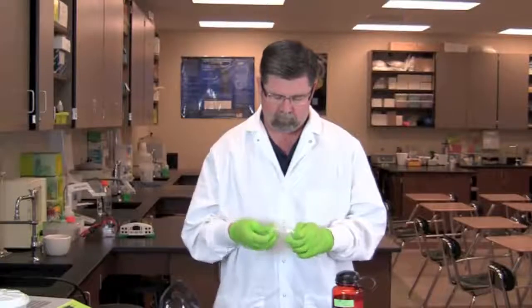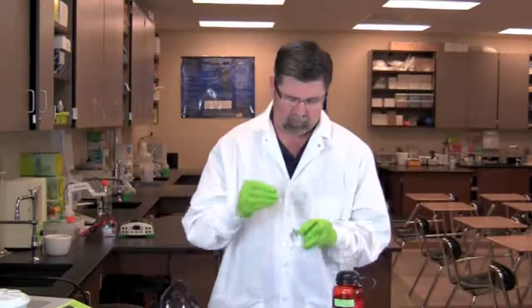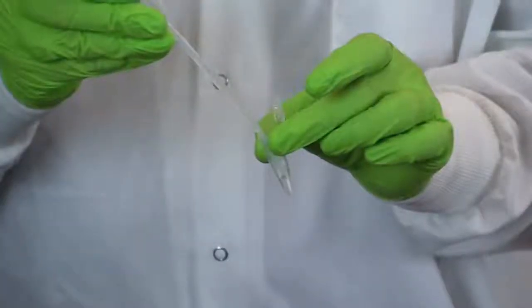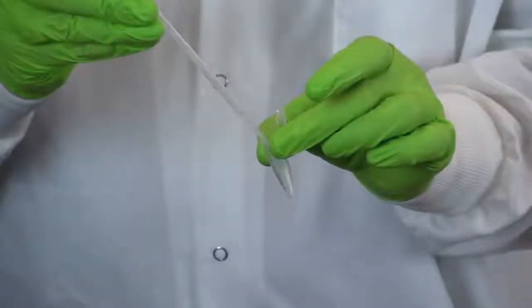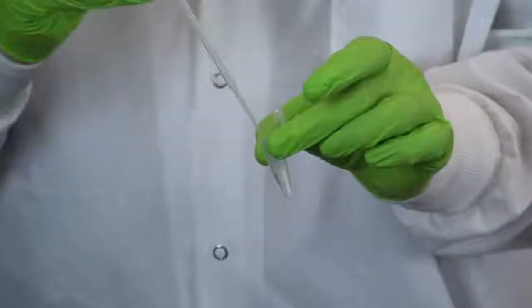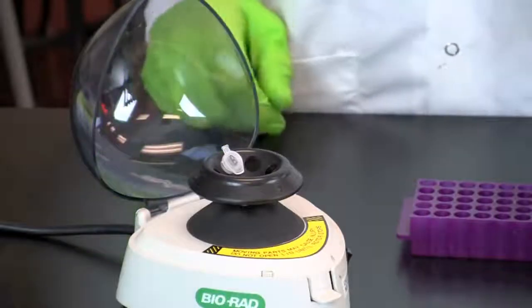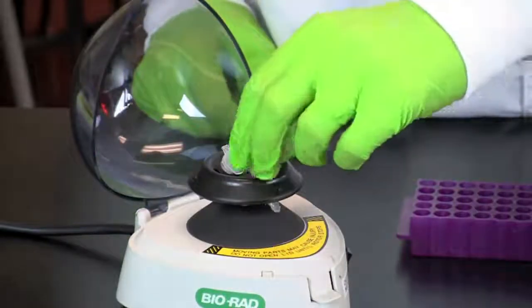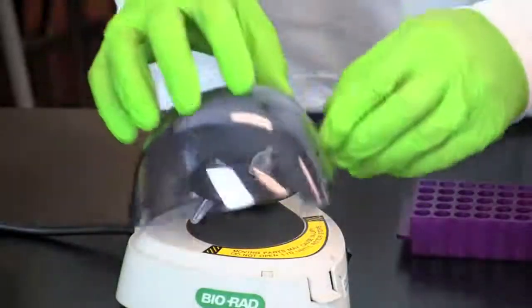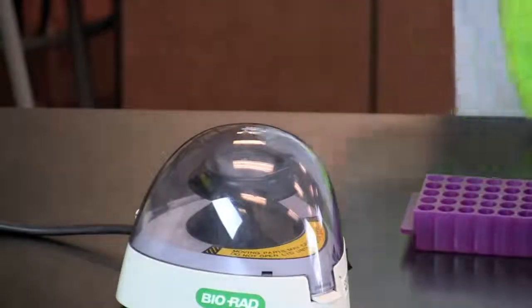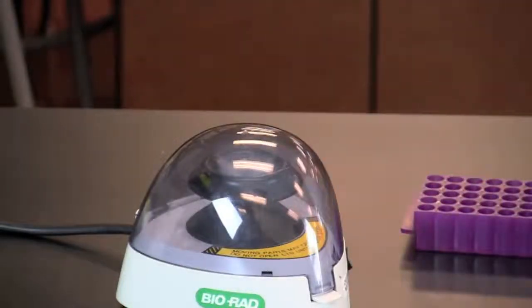Pipet 1 milliliter of mouth rinse into a 1.5 milliliter flip-top microcentrifuge tube. Place the tube into the microcentrifuge in a balanced configuration. Place the hinges of the tubes facing outward so that the pellet will be easy to locate after spinning. Centrifuge at maximum speed for 2 minutes. If you are using a mini-centrifuge that can only reach 2,000 g's, centrifuge for 5 minutes.